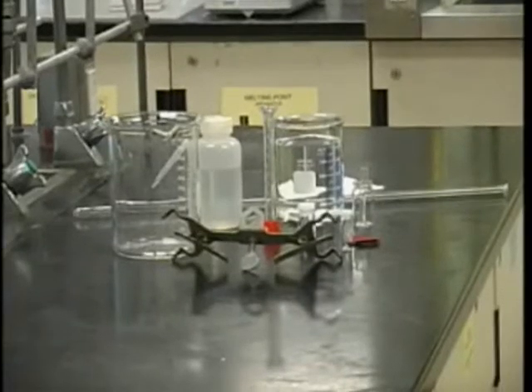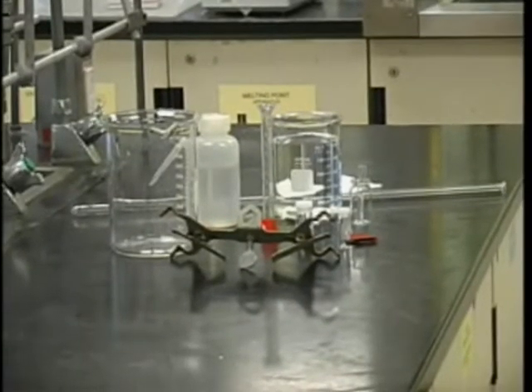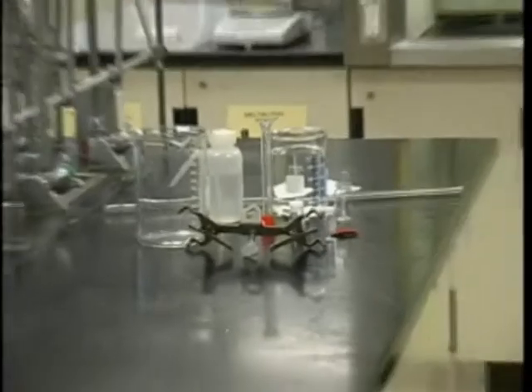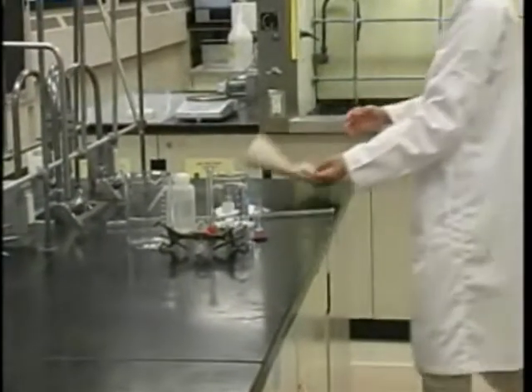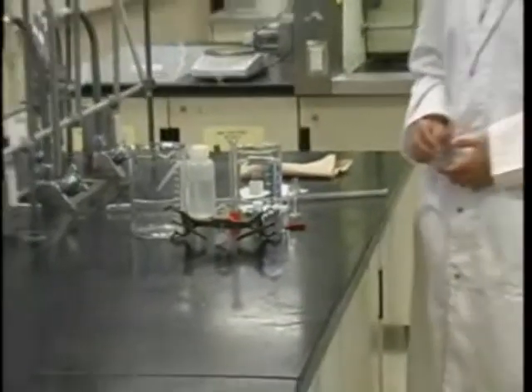In Experiment 2, you will be determining the percent purity of one of two metal samples and determining the percent composition of an unknown alloy sample.